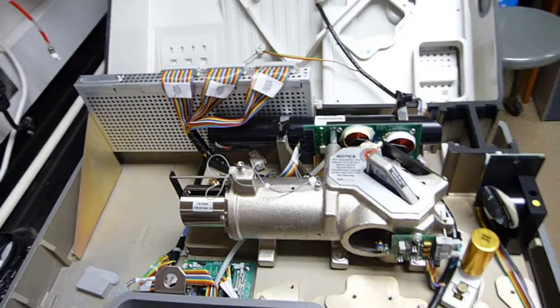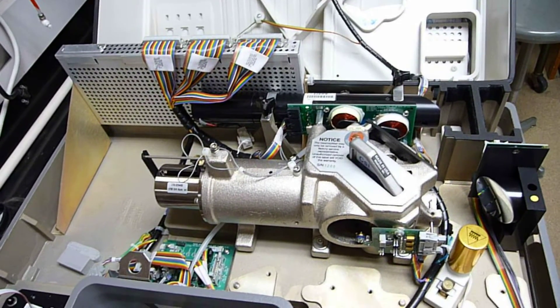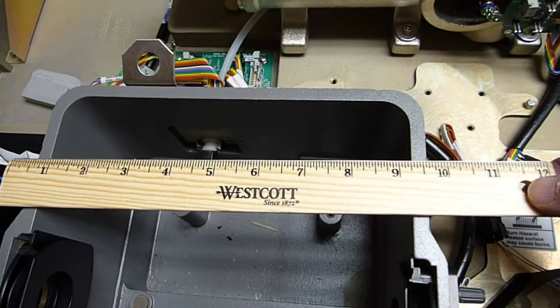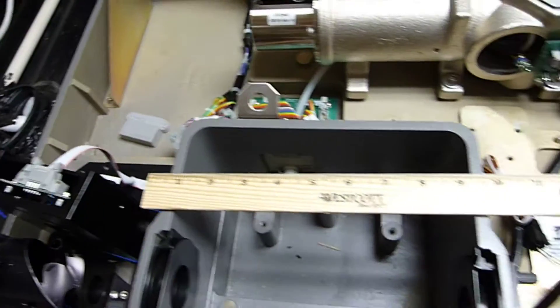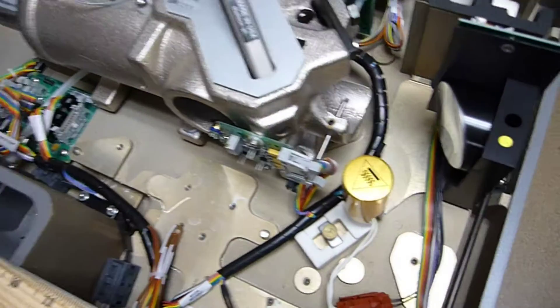I flipped open the cover of a Nicolet 4700 FTIR. Here's a 12-inch ruler to give an idea of perspective. It's not powered up, but let me just go through the components. Over here we have the source.